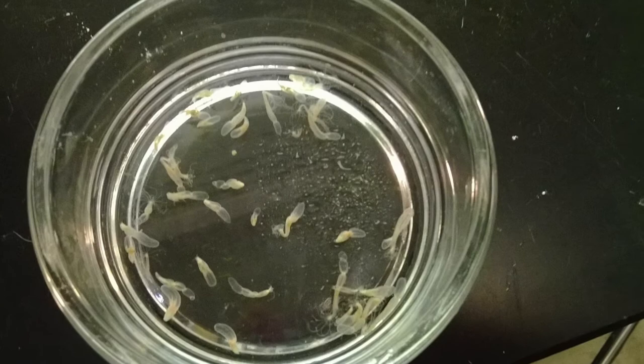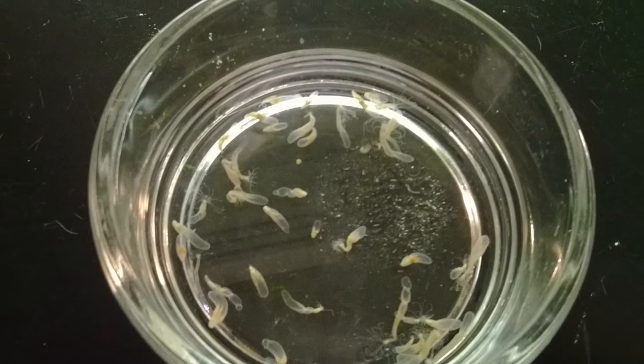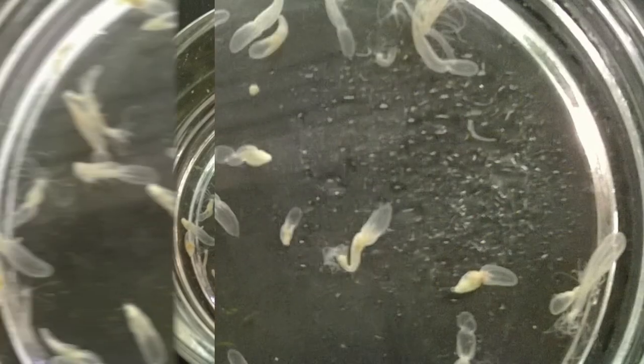The nematostella eat brine shrimp from Brine Shrimp Direct, and the brine shrimp are hatched in 40 ppt water overnight. The nematostella reproduce sexually and asexually, and have the ability to regenerate any part of their body no matter how much is amputated.